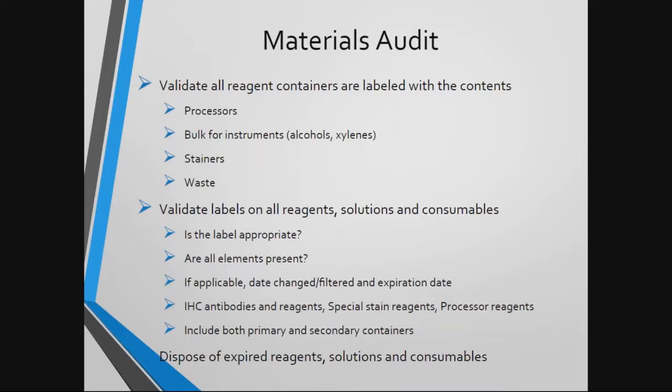Again, this includes all IHC antibodies and reagents, special stain reagents, and processor reagents, and includes not only those primary containers, but the secondary containers as well. We'll talk a little bit more about this in the following slide. And make sure you dispose of anything that is expired. This leads to a very frequently cited deficiency.